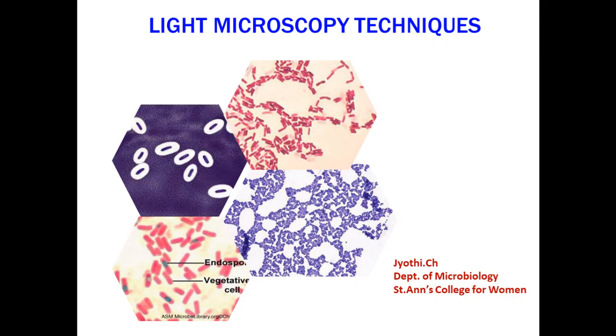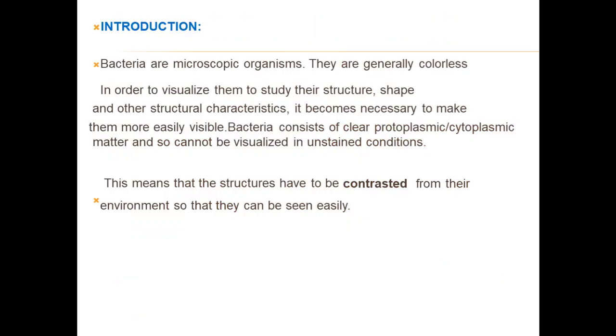Hello girls, in today's video lecture we are going to learn about specimen observation techniques in light microscopy. So we all know that microorganisms cannot be visualized with our naked eye. When microorganisms cannot be visualized with the naked eye, we use an instrument called a microscope to observe them.